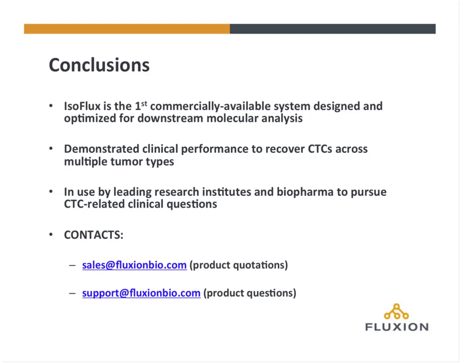Okay, there's a question here. Why is your system better than CellSearch? And is this due to better capture by our kits or a stronger magnetic field by the microfluidic system? Definitely a good question. I tried to touch upon that a little bit in this presentation, but just to clarify, it's not necessarily a stronger magnetic field within our platform. It has more to do with the uniformity of the magnetic field and making sure that every cell that has a magnetic bead is properly exposed to that magnetic field to improve the capture.